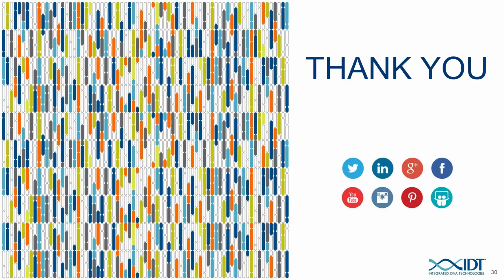Okay. So one more question for you. Is there a good method for suppressing the mechanism for non-homologous end joining in order to increase homology-directed repair efficiency? There are a lot of different methods that have been discussed in the literature. The most common of which is probably the SCR7 small molecule, which, trying to think of it, might be a ligase inhibitor, but the verdict from what I've seen is still out on whether or not there's one real runaway winner at suppressing non-homologous end joining.